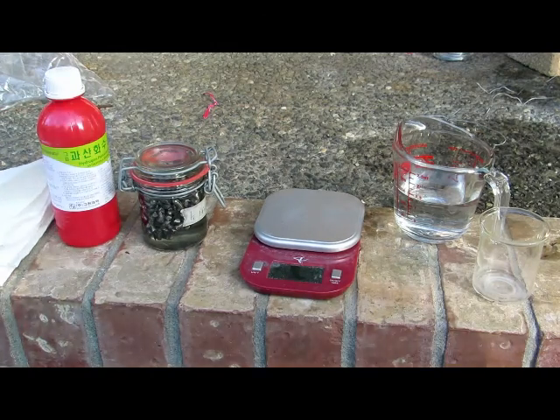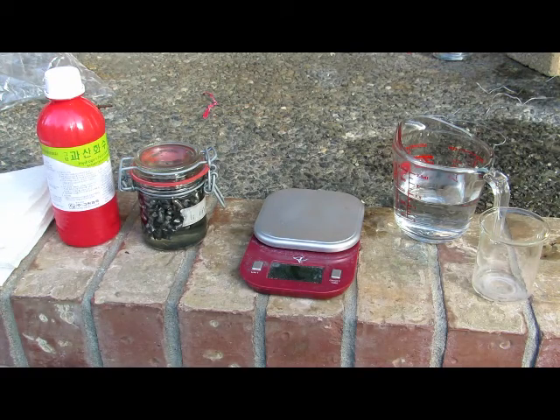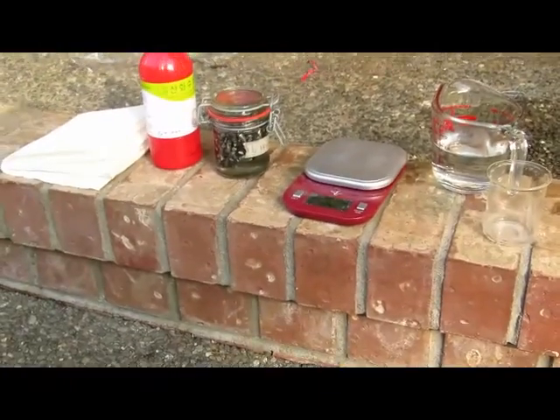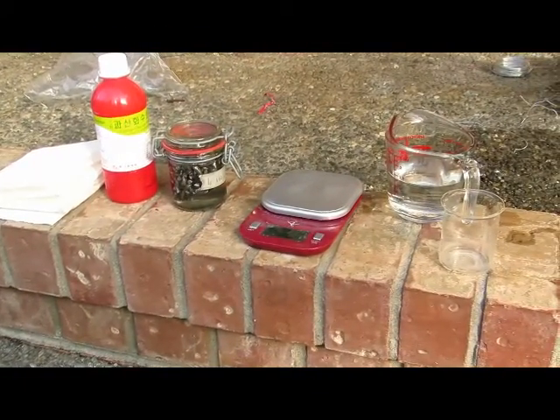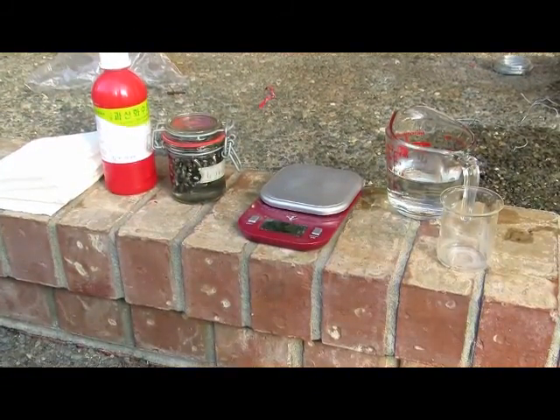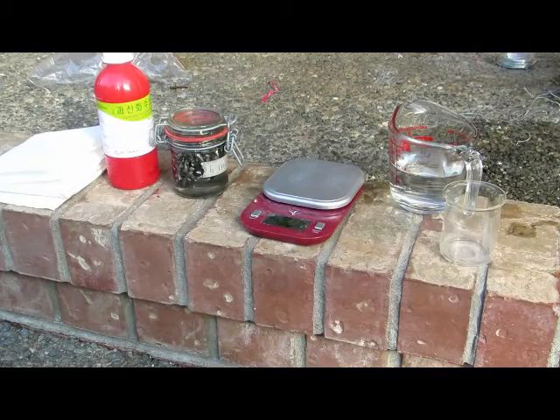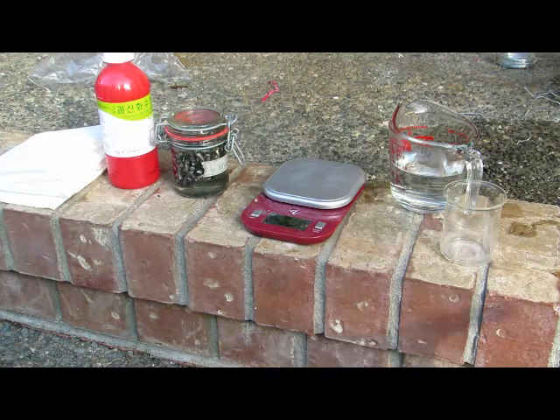Hey guys, welcome back to another video. Today we're going to be making a compound called lithium peroxide. My friend Sam is here and that's Kate. We have a science project to do about the carbon cycle. Lithium peroxide is interesting because it will absorb carbon dioxide from the atmosphere and release oxygen, kind of similar to how trees do it, except it's a chemical process instead of a biological process.